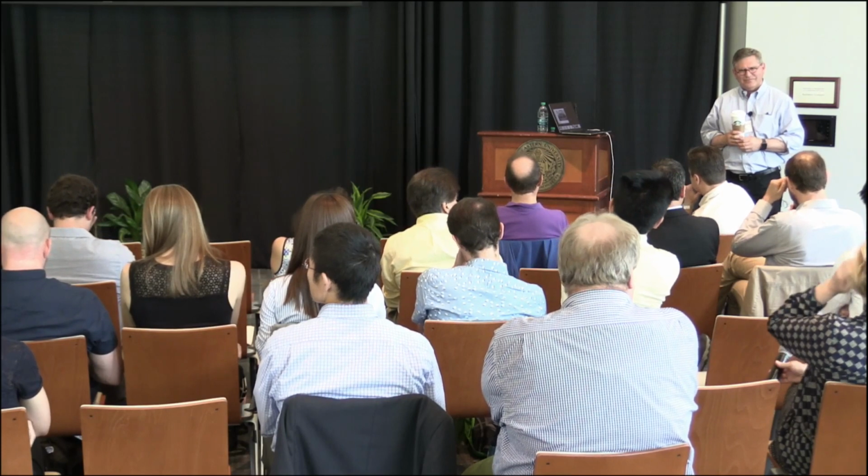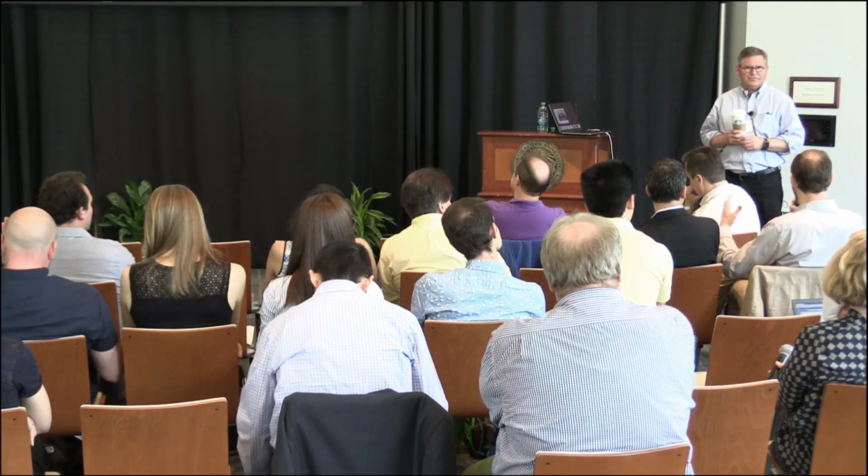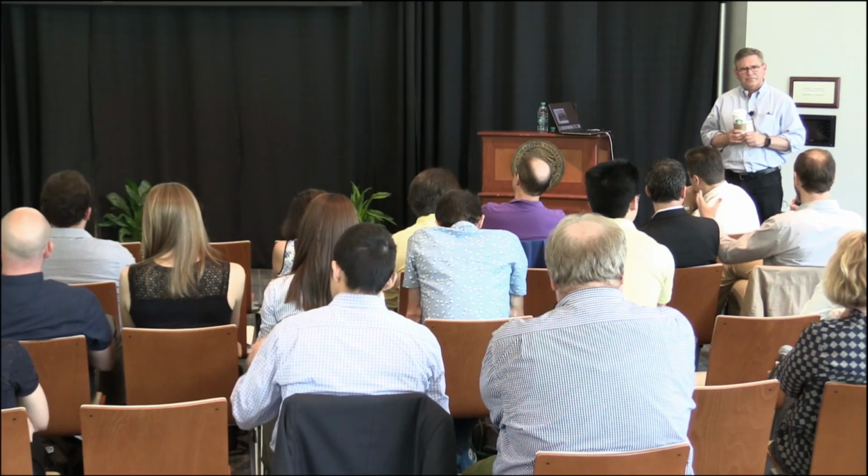My question is, since this all started, clearly computers improved, technology improved. We have amazing mass specs right now, and at the current state, with a 90-minute gradient, more than 1 million mass spectra could be acquired, right? According to all these improvements, my general question, and you're one of the few people I would like to ask this: how would you explain that, with all those improvements in technologies and databases being absolutely complete, you never get a full 100% explanation of all those MS spectra that come in of clearly peptidic nature? You see the peptides, amino acids. What are those? What is your opinion?